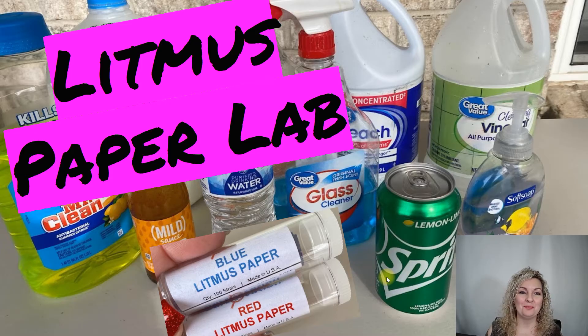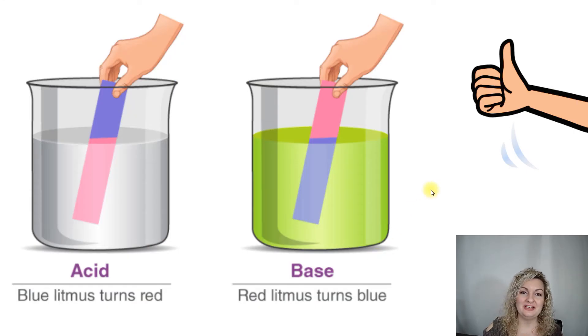We're testing substances that are household products, and we're going to use these bottles of litmus paper — blue paper and red paper. When you dip the blue paper into a substance and it turns red (really it turns pink, but we'll call it red), that means that you have an acid.